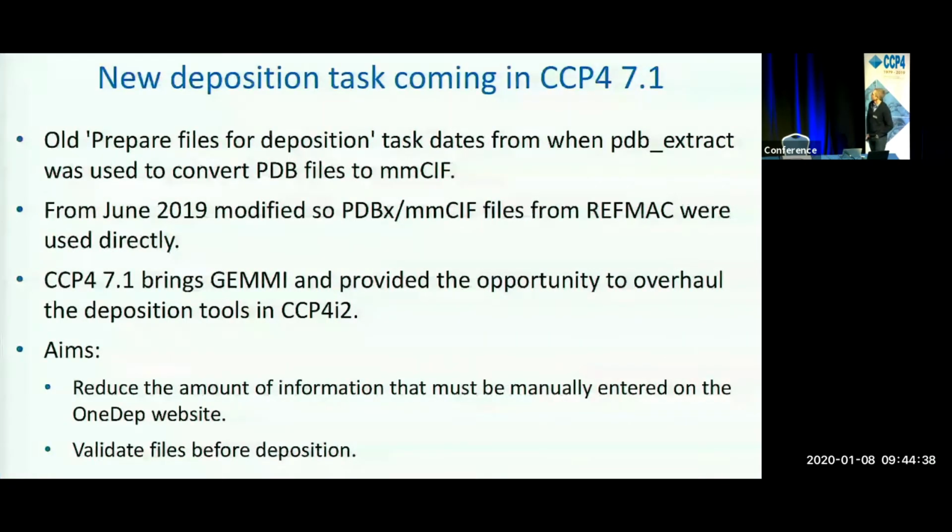As Phil said, CCP4 7.1 is going to bring Gemmi, which has provided us the opportunity to completely overhaul the deposition task in CCP4i2. And the aims we're working with were firstly to reduce the amount of information that you have to manually type into the OneDep website when you deposit your structures, because people are publishing papers with more and more structures at once these days, and so typing this sort of stuff in is pretty frustrating.